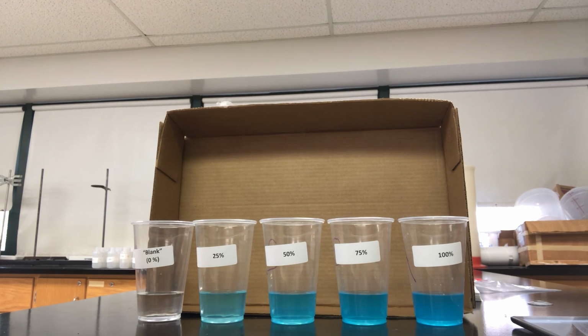Take a look at these solutions. You can clearly see there's a difference in color as you go from left to right. These are different concentrations of Cool Blue Gatorade. The one on the right is full strength, the one on the left is plain water.